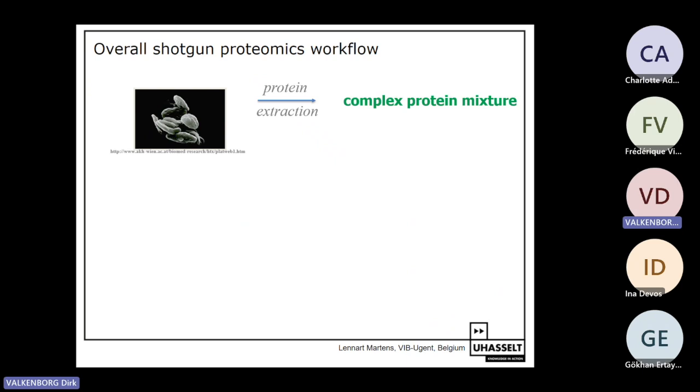Although there are fractional differences, they are pretty well behaved, as opposed to proteins that can come in all sizes and forms, and it's much more complicated to do proteomics at the level of proteins, although some groups are investigating this as well.